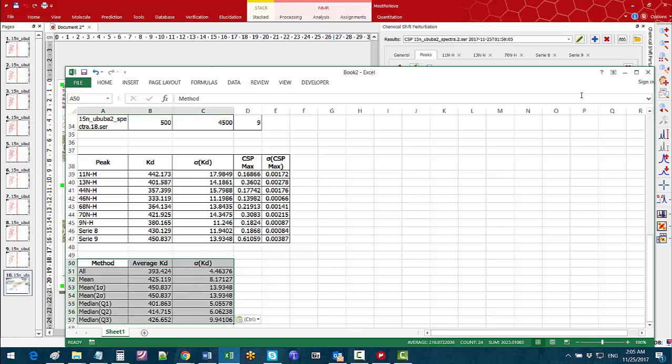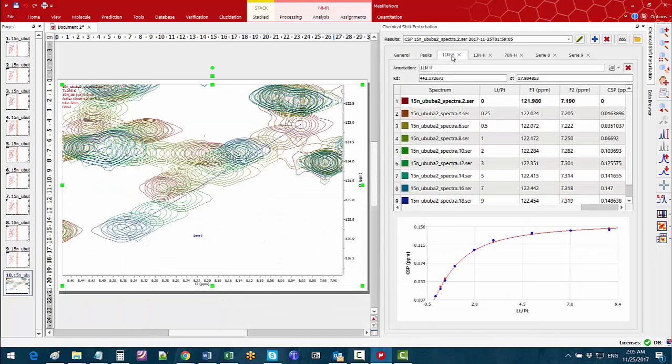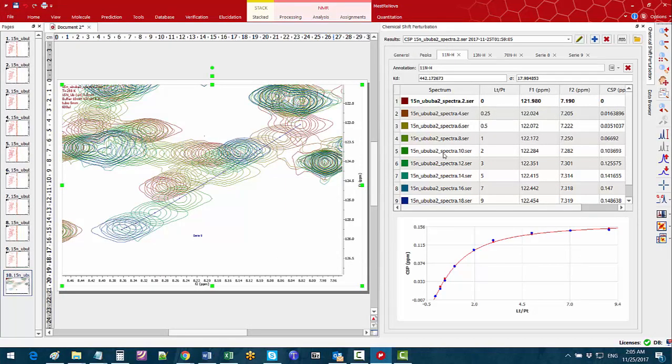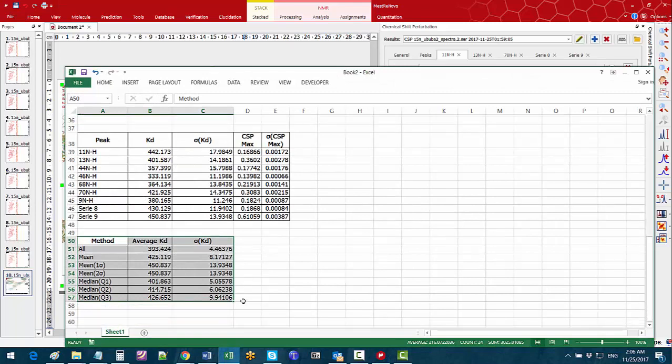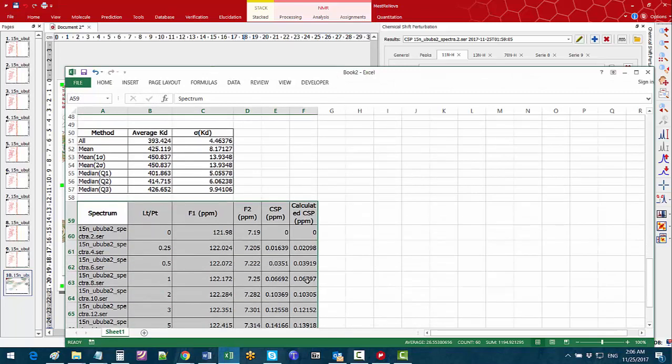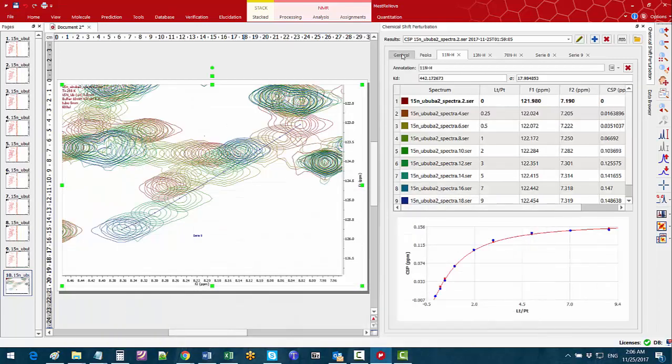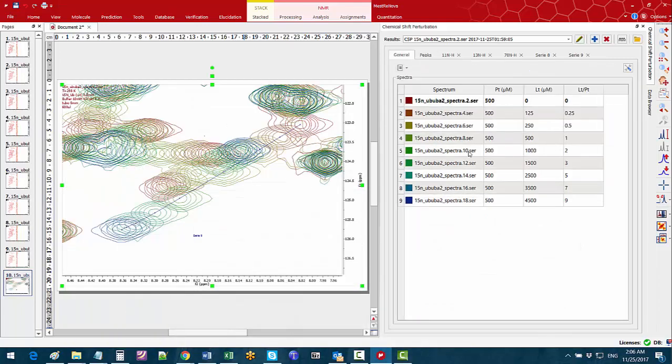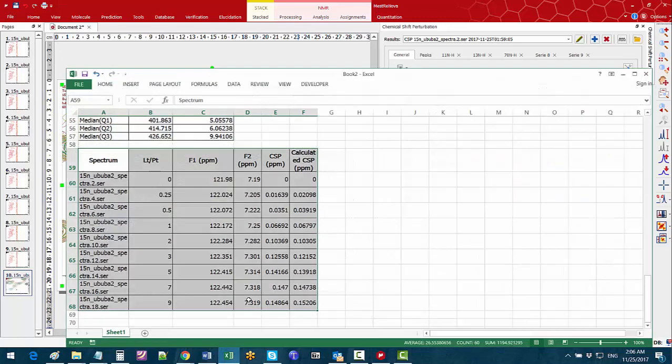If we are interested in the details of a particular peak we can switch to this peak tab and use the tool copy report and again paste it on the spreadsheet. If we are interested in a report of the whole series in terms of the chemical shift concentration values then we can go back to the general tab and click on the copy tool and paste the results.